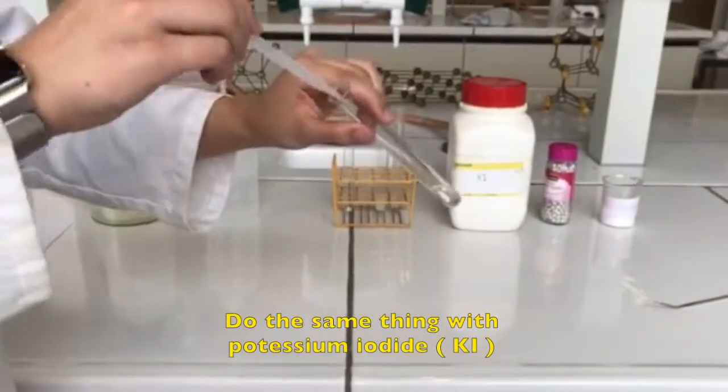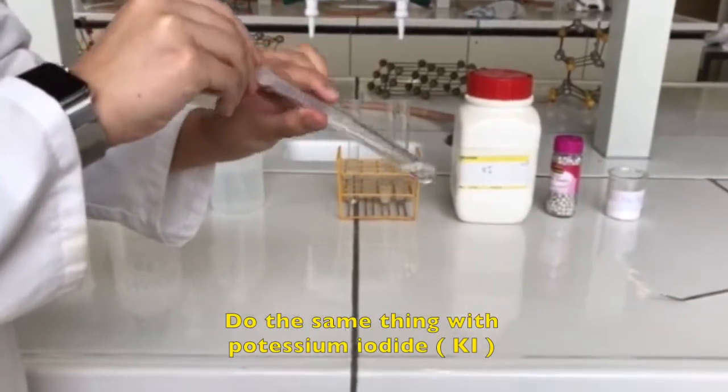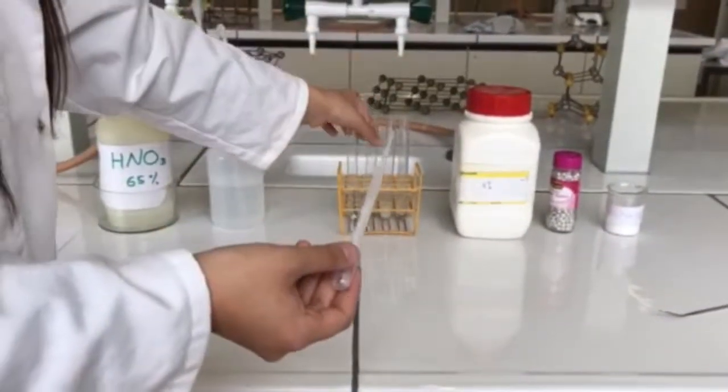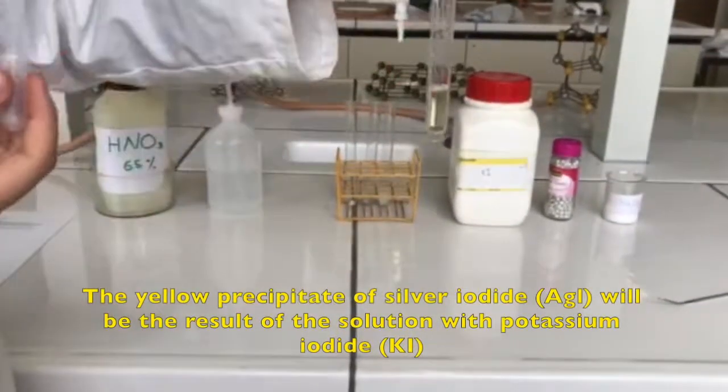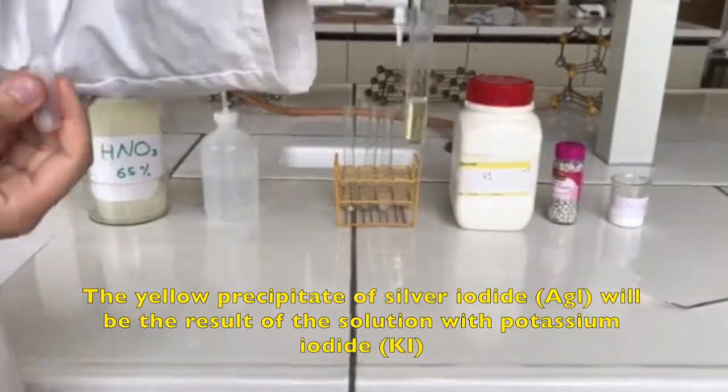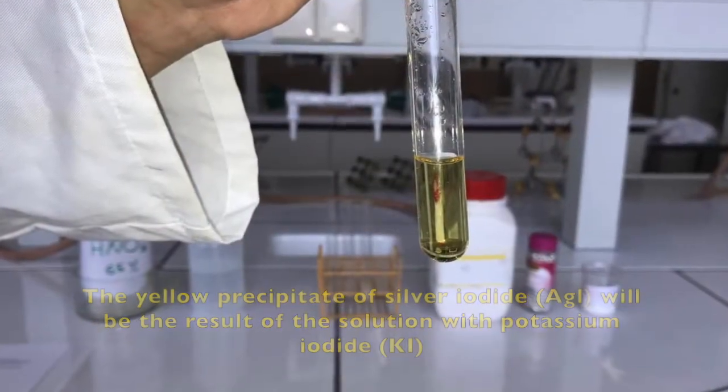Do the same thing with potassium iodide. The yellow precipitate of silver iodide will be the result of the solution with potassium iodide.